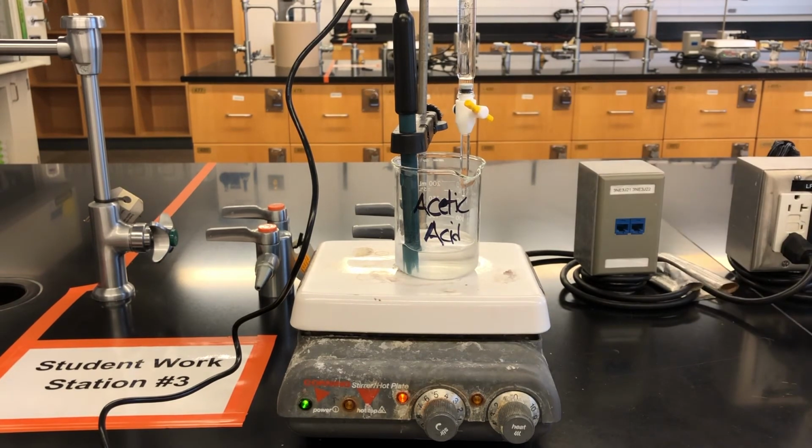With that, the titration is complete. We clean up, rinse off the pH probe, and dispose of the reaction mixture into the waste beaker before moving on to Part C.